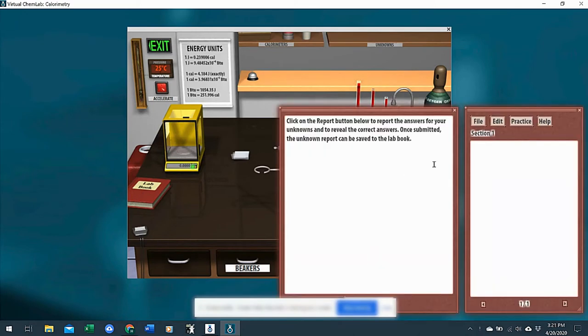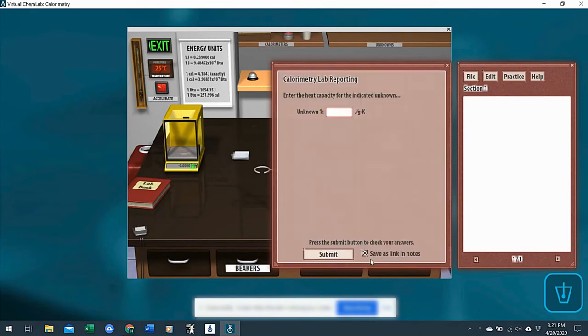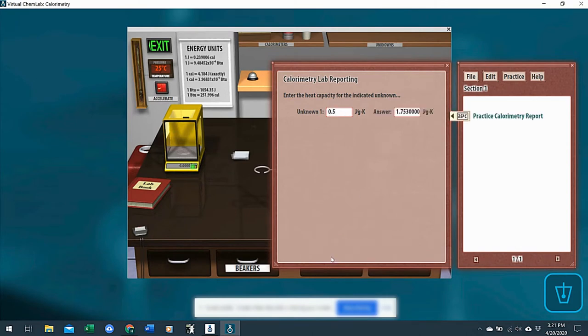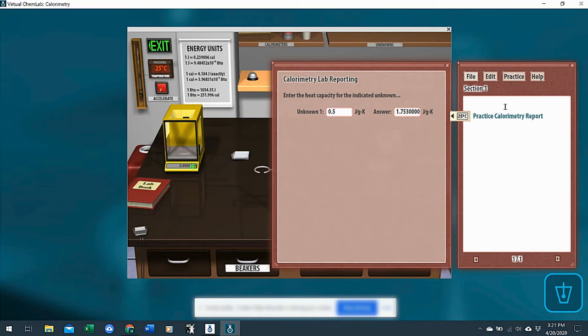So they do that by clicking on the lab book button, and then clicking report, entering the value they think that heat capacity of their block has whatever type of metal it is. So say that's their calculated guess, then they get their answer here. And so then they would submit this to you. They could enter in any data they need here. This is from trial one.